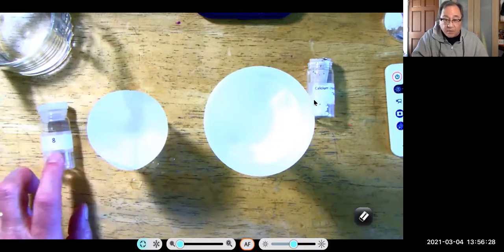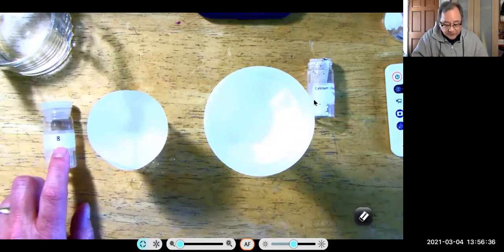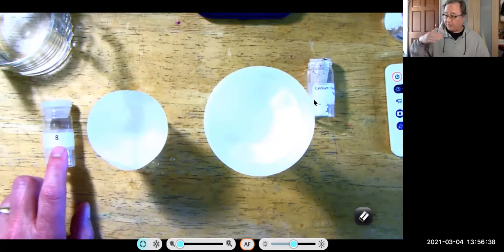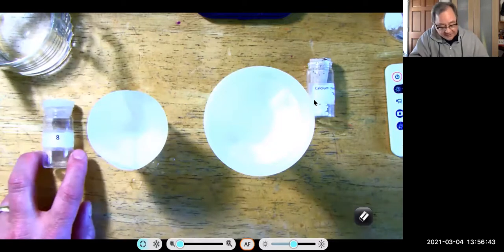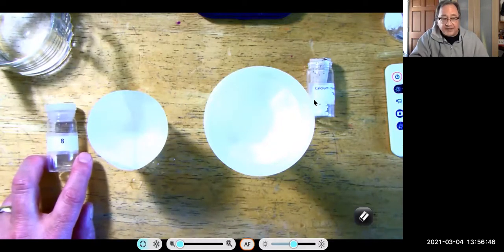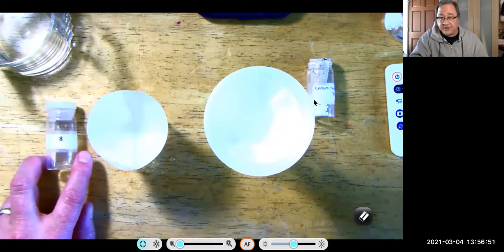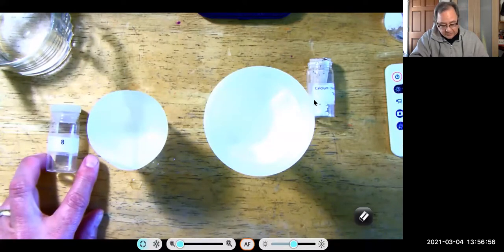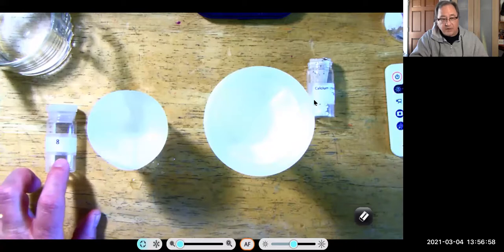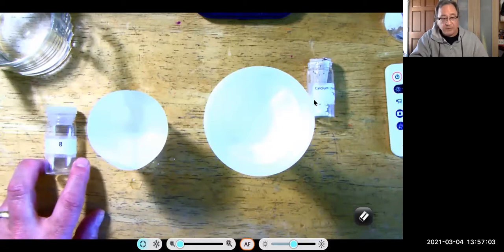But that means in your lab write-up, you must, as a piece of data, write down the number of your unknown. So this one's number 8, and I have a little list that says, oh, number 8 is lithium carbonate or something like that. Actually, I don't have the list yet. But nonetheless, I then will be able to look at your lab write-up and put in the comment section, your number 14 was blah. Okay, so you won't be able to talk about whether or not you were right or wrong with the lab write-up, but you will with the lab report.